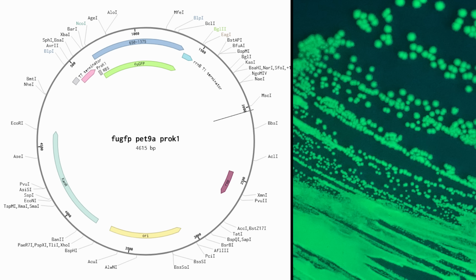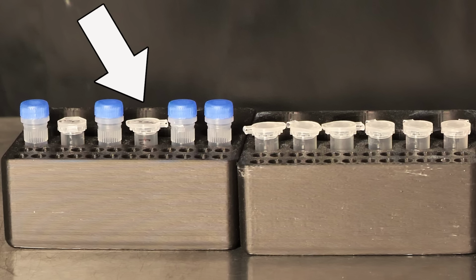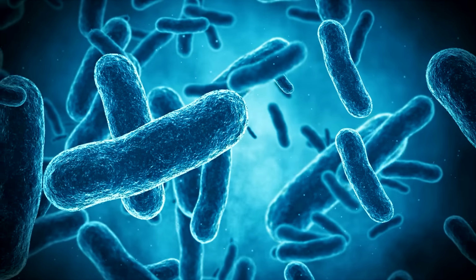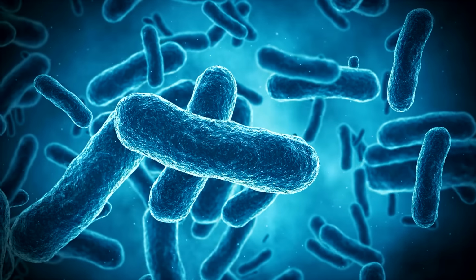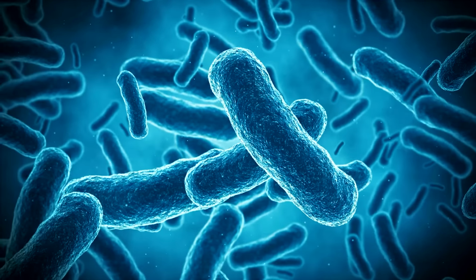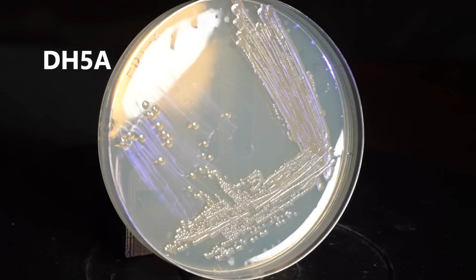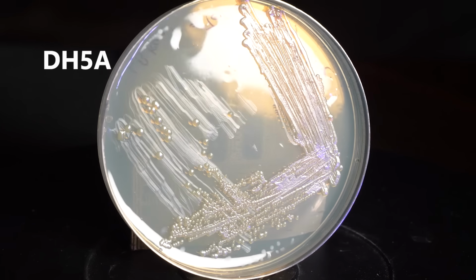To start with, I've got a plasmid that codes for a bright green fluorescent protein in this tube. But how do we get the DNA into the bacteria? Also, it's actually not enough to just say, I want to use E. coli, because there are many strains to choose from. I'm going to be using this plate of E. coli strain DH5A as the starting point for this process.